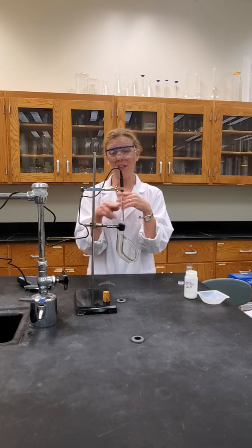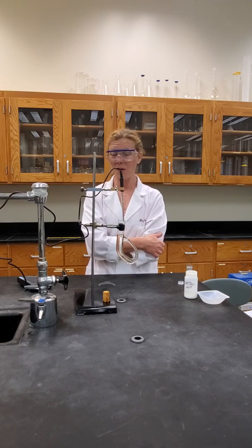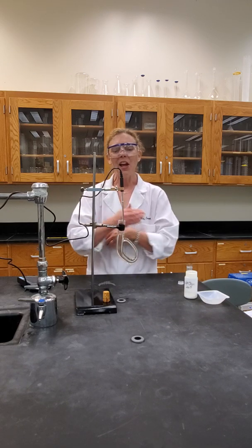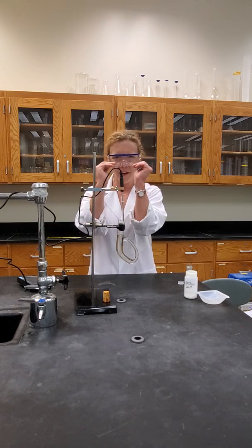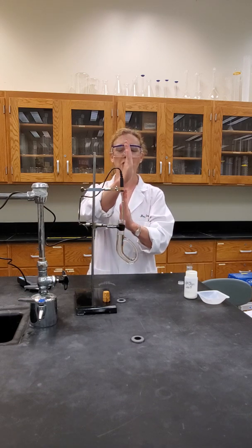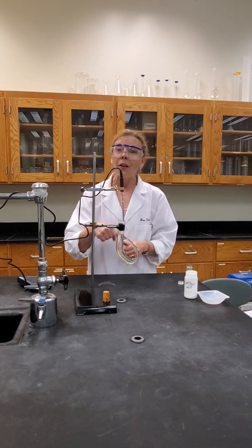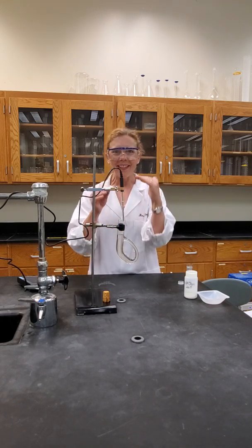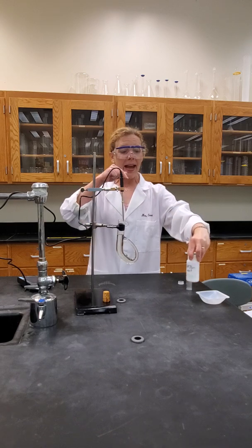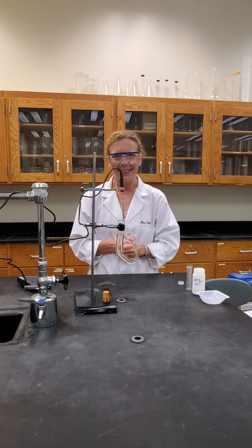This, when it's exposed to the lower temperature of the air, will solidify for you. It is still the same pure compound from your previous trial. So you'll relower it, note the start of liquefaction and then the final, get the midpoint. Hopefully your 2 trials will agree. If you are collecting data from 2 trials, average the midpoints to determine the identity. There is a table of known solids that your unknown may be, and their theoretical melting points that you can use to identify what your compound is.